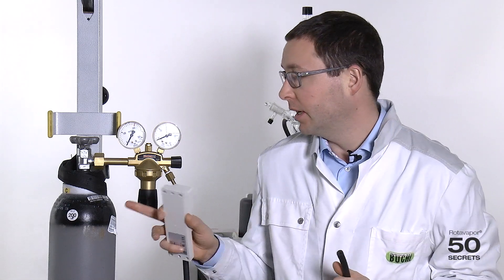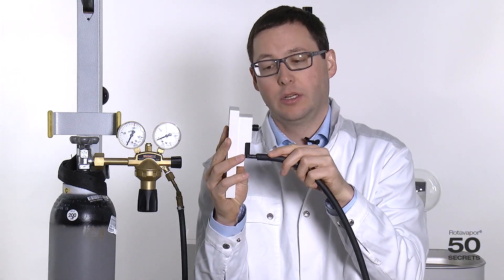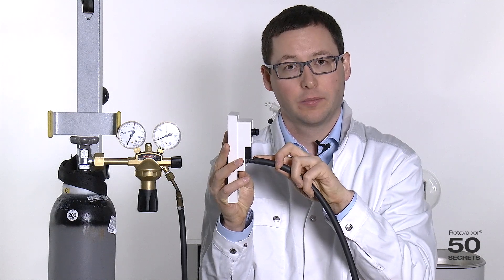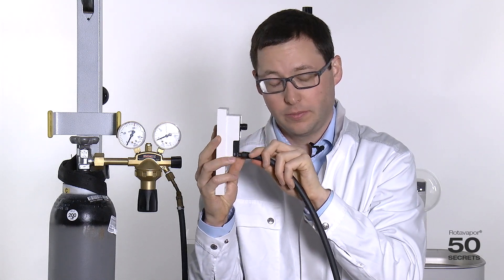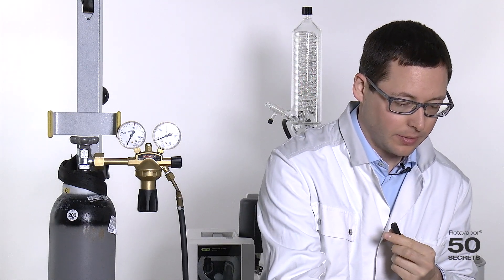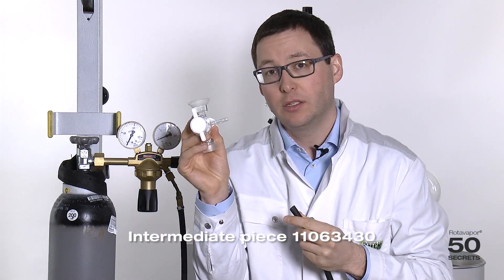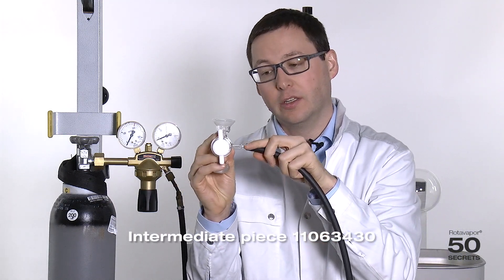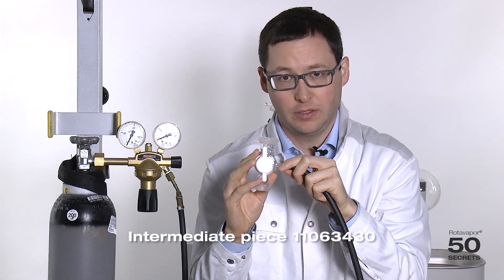First, we attach the nitrogen to the vacuum box outlet. This is what we will show. And second, we could use this intermediate piece to connect it here to float the system through the intermediate piece.